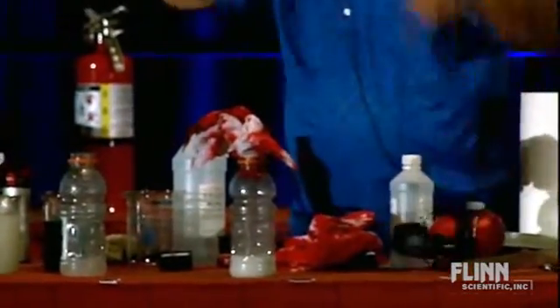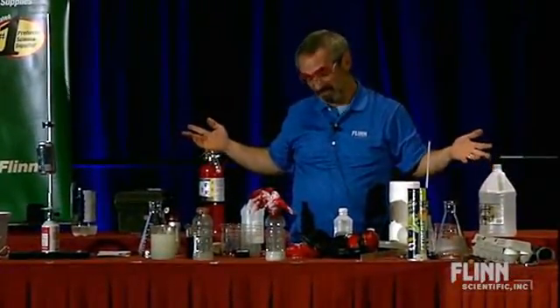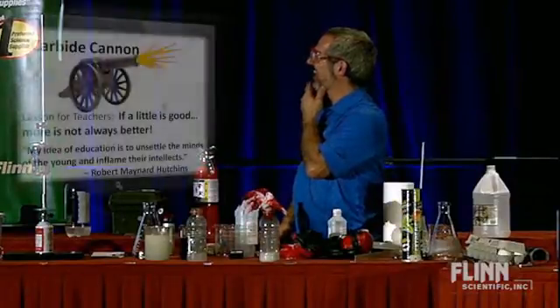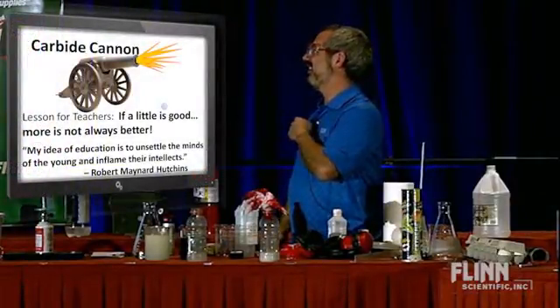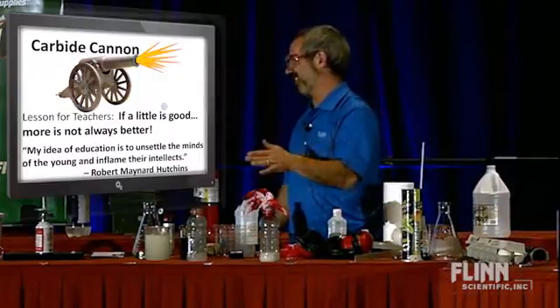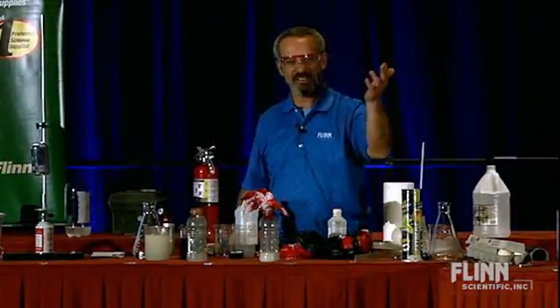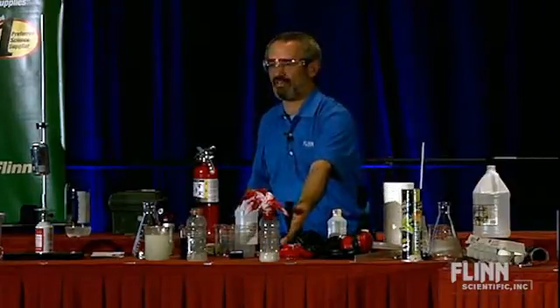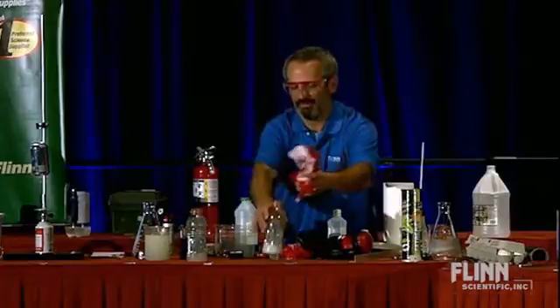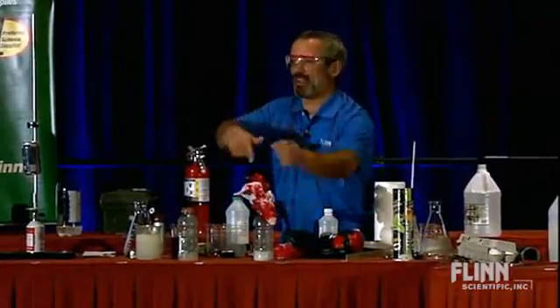Some people in the front weren't even covering their ears because they anticipated it — what's with that? Well, my reaction was kind of a dud. Lesson for teachers: if a little is good, more is not always better. We produced so much acetylene that it pushed out so much of the air — there's virtually no oxygen left, not enough to create an explosive mixture. I could try adding more, but that's not very careful. Don't expect the super loud one because I just blew out a bunch of the acetylene too.